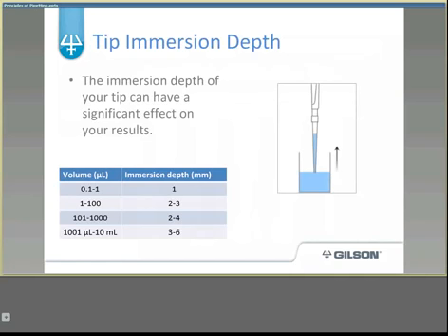Tip immersion depth is another important consideration, as it can have a significant effect on your results. If the tip is immersed too deeply in a sample, droplets will form on the outside of the tip and be deposited along with the sample. If the tip is not immersed deeply enough, vortexing can occur and the pipette will not aspirate the selected volume.